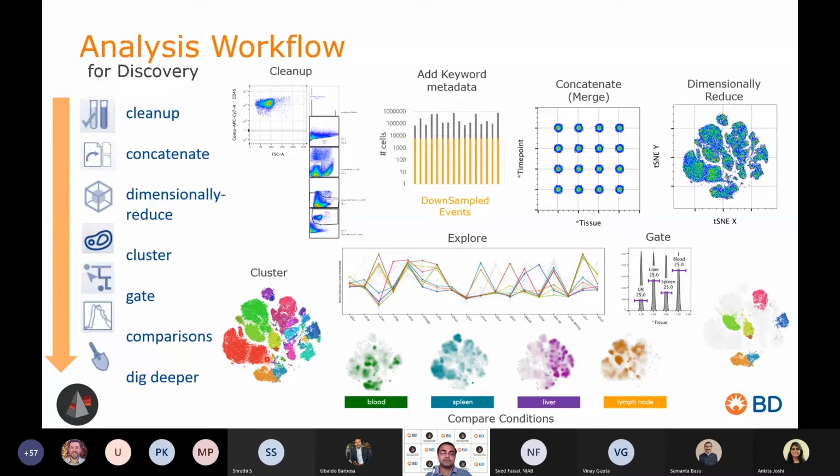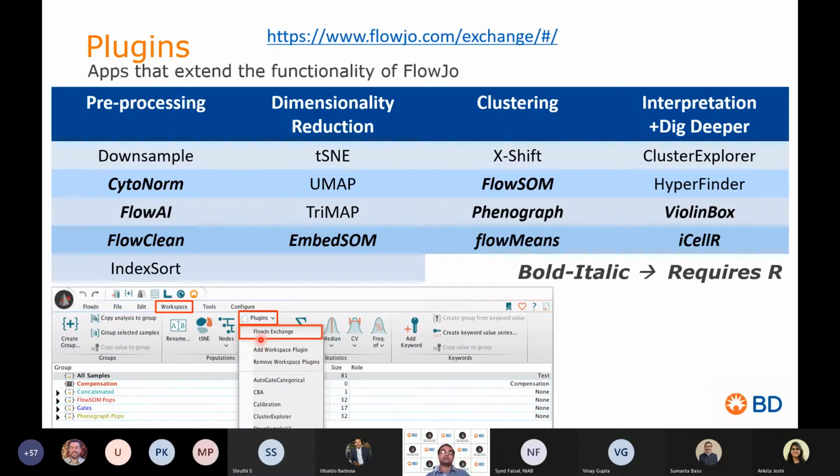And these are the FlowSOM clusters, where you just drag and drop all the clusters that you derived out of any clustering algorithm into the layout editor in FlowJo, and it creates actual populations of cells which have similar phenotypes. They are grouped together, and those which have dissimilar phenotypes are just pushed apart and form different islands. So that's a brief summary before we go into the details. Now we go into each step with a lot more detail.